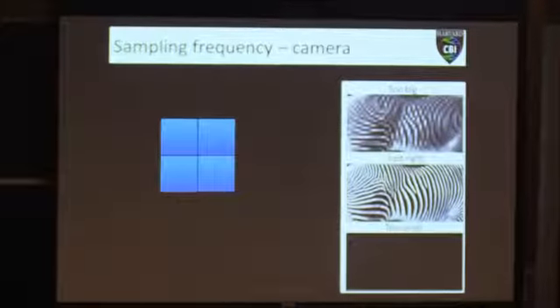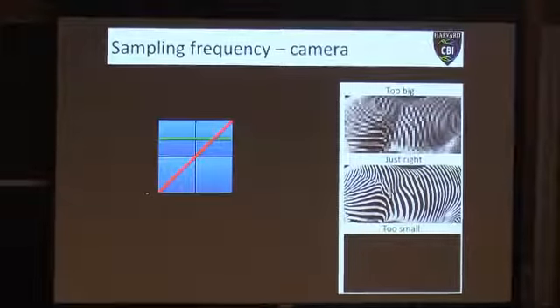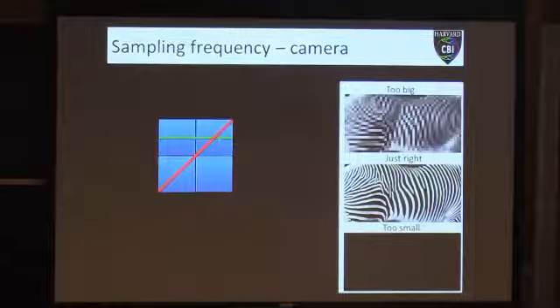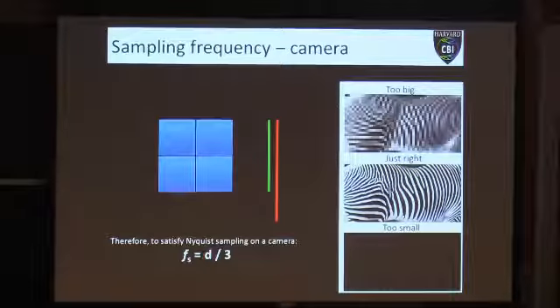This gets a little bit different for a camera. The reason for that is we have square pixels. And so if you have a sample lying in this direction, each one of these pixels comprises half of that. If you have one lying this way, you can see that the amount of, say these are microtubules, the amount of microtubule in each pixel is actually bigger. So we just separate those out. So here the 2.3 calculation doesn't really work. What you actually want to do is use a 3. So whatever your unit of resolution is, divide that by 3 to get what your pixel size should be.